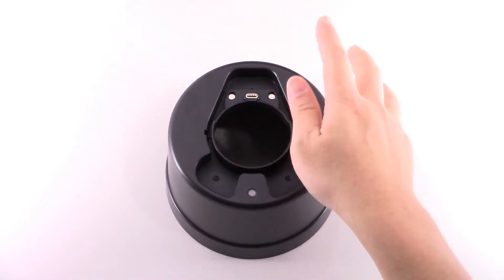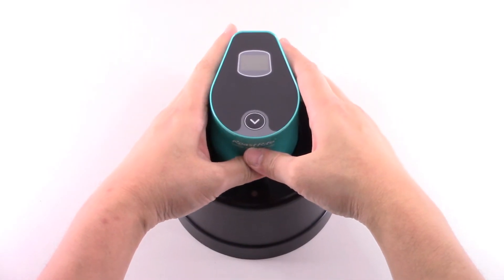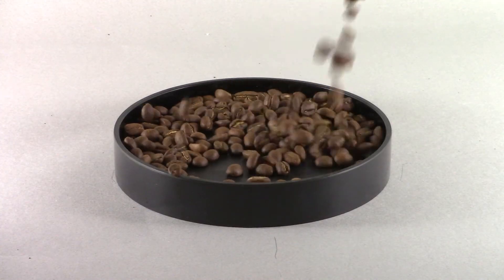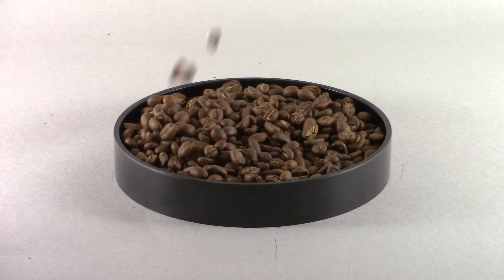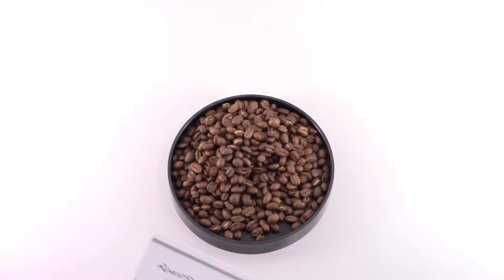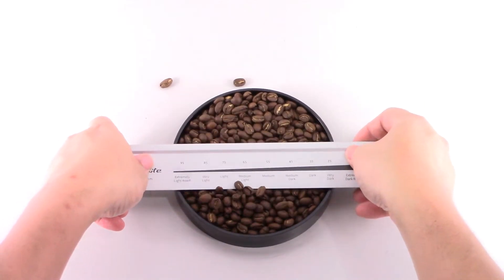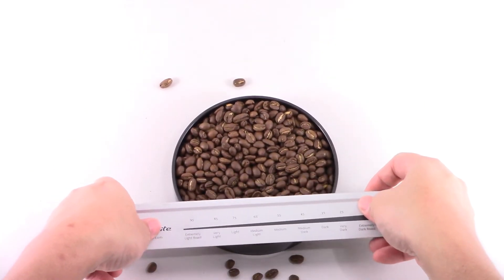Place the analyzer on the bigfoot attachment. Pour around 80g of coffee beans into the sample tray. Press and push off excessive beans with the scraper ruler, then flatten and even out the surface to match the height of the ribs.